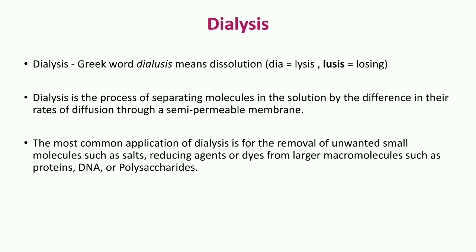The most common application of dialysis is removal of unwanted small molecules such as salts, reducing agents, dyes from large macromolecules such as proteins, DNA, polysaccharides which are present in the cell lysate after the process of homogenization and centrifugation. Dialysis can also be commonly used for buffer exchange and drug delivery systems.